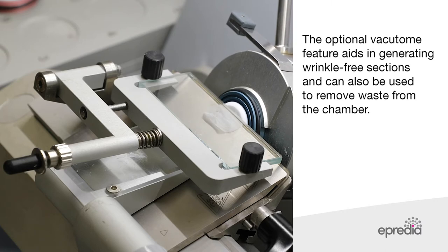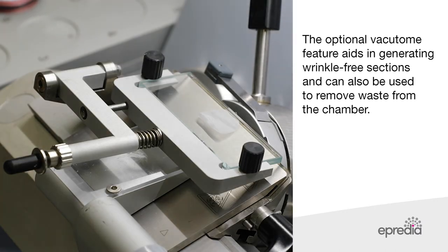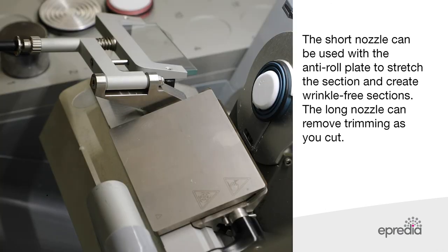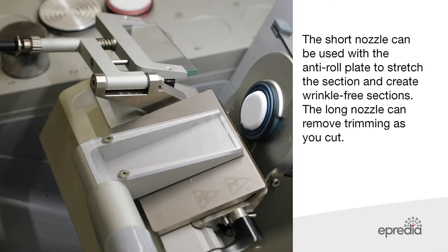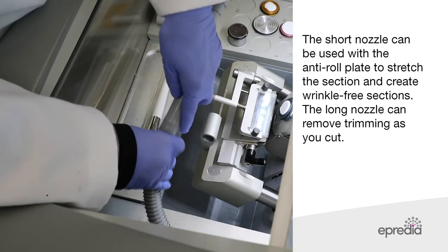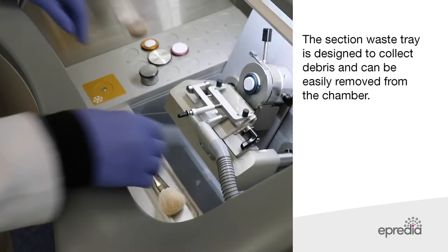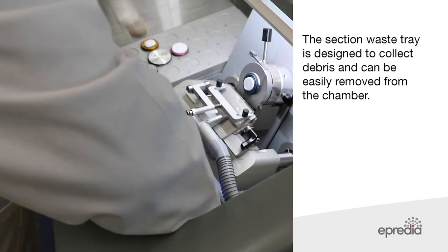The optional vacutome feature aids in generating wrinkle-free sections and can also be used to remove waste from the chamber. The short nozzle can be used with the anti-roll plate to stretch the section and create wrinkle-free sections. The long nozzle can be used to remove trimming as you cut. The section waste tray is designed to collect debris and can be easily removed from the chamber.